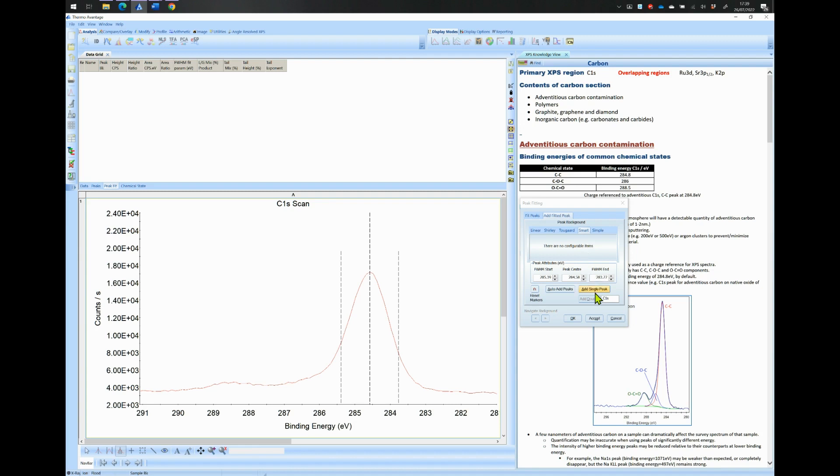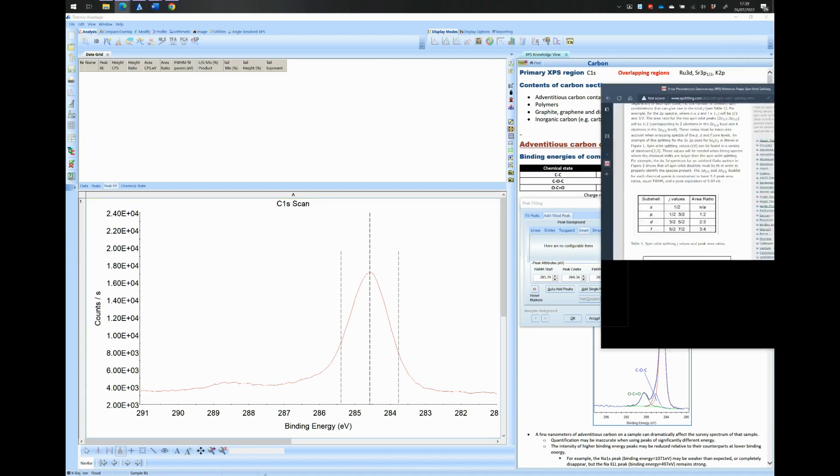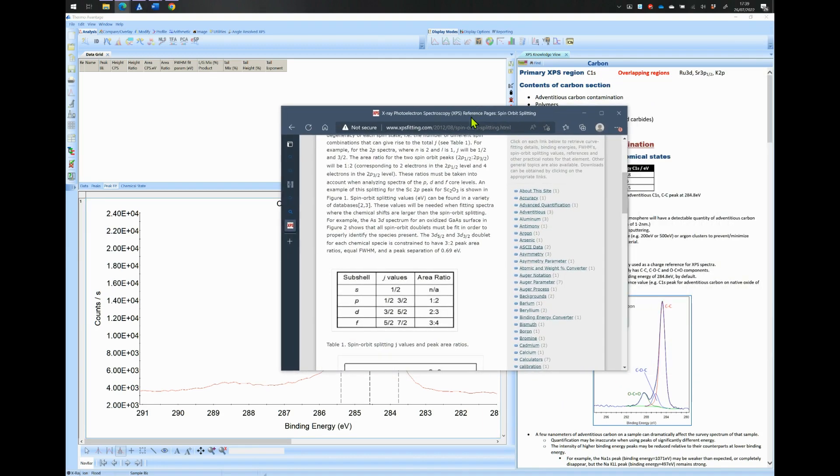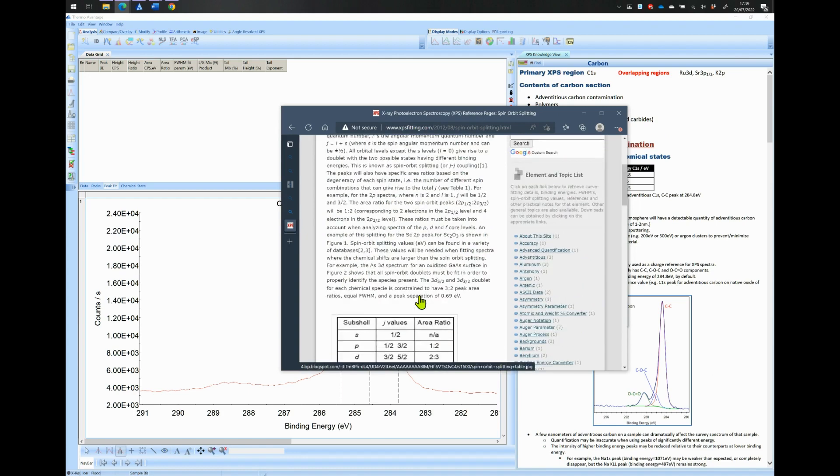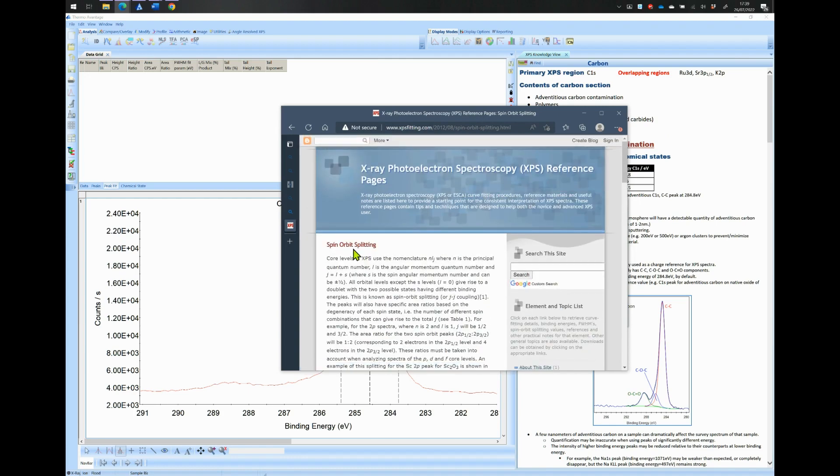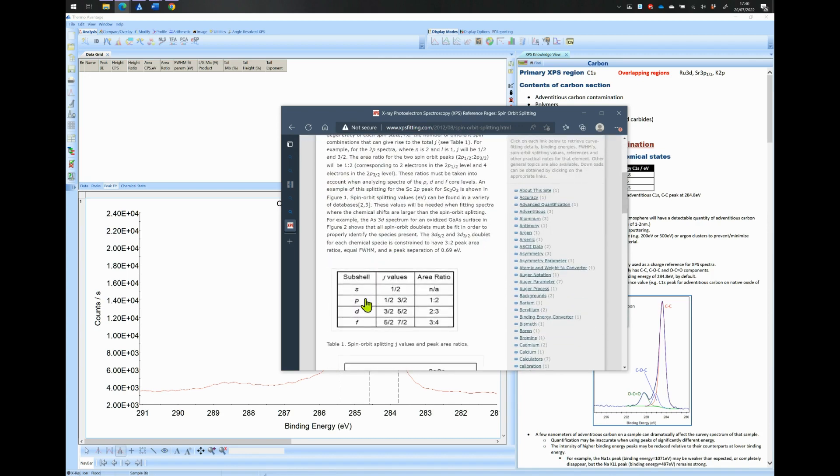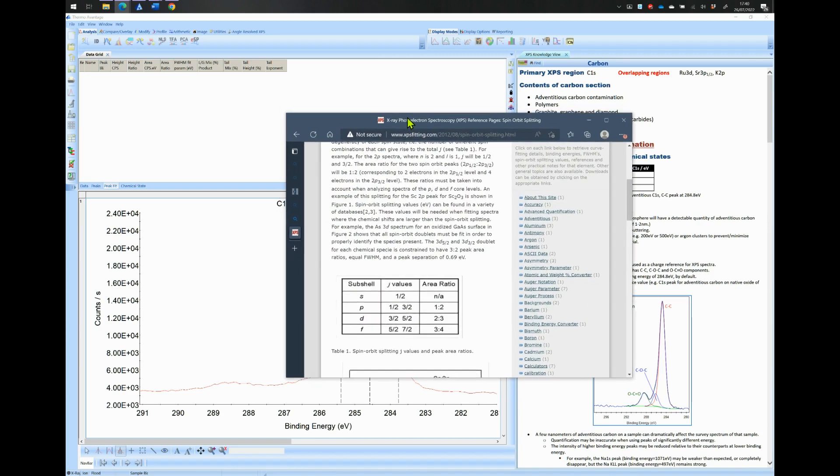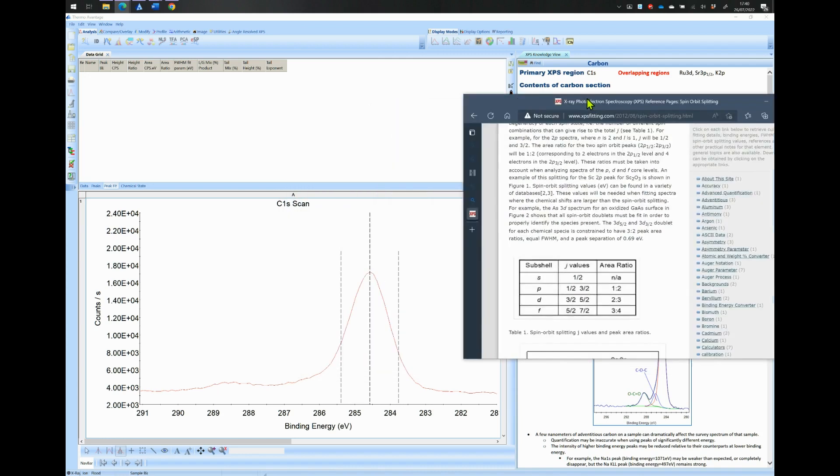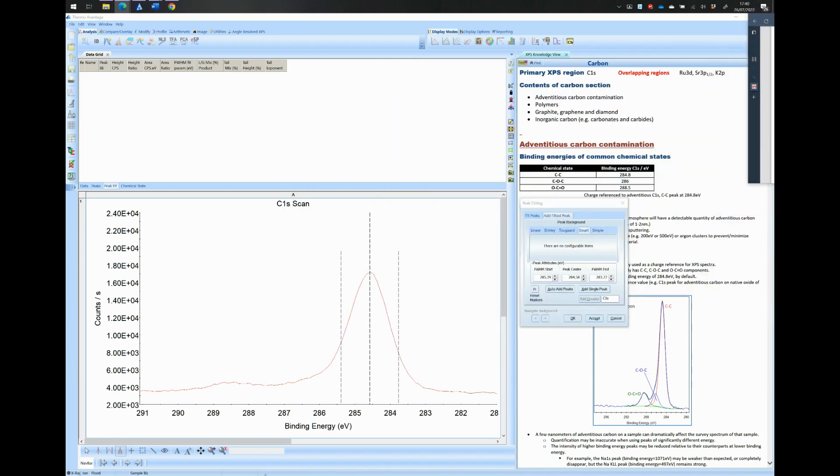Now, before doing any peak fitting, I strongly advise you to learn about spin orbit splitting and particularly about the S, P, D, and F subshells. Learn about the reason these subshells are split into doublets. In the case of the Carbon 1s, the 1s feature is made of only a single component. So going back to our fitting using single peak component.